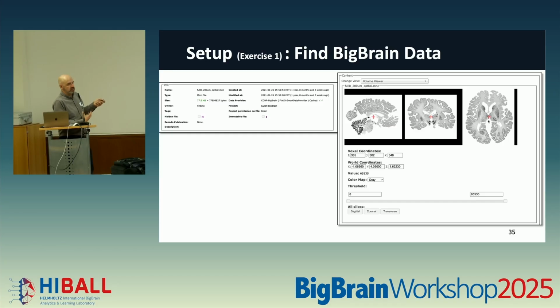So this is using what's called the BrainBrowser component that was developed as part of CBRAIN years ago, and we still are maintaining as part of the environment. So you have the nice piece of working with the image. You can visually inspect the file directly before doing anything that you want to analyze it with, just to get a feel for that, okay? Is anyone having any difficulties, or did it load okay for you, the 10 megabyte file? Okay, great. The 78 one takes a little bit longer.